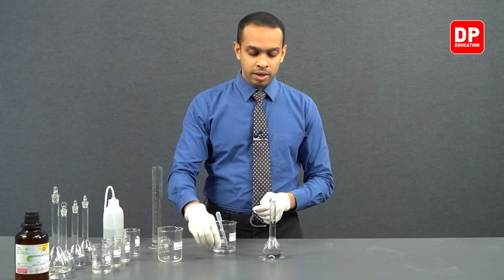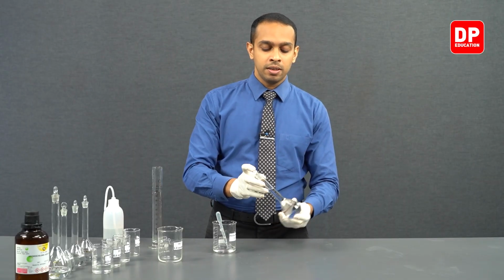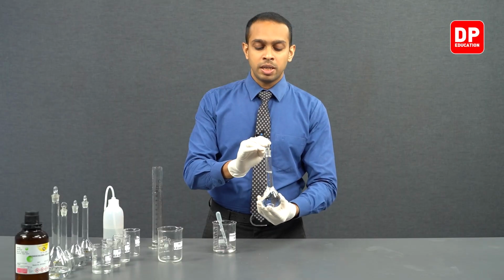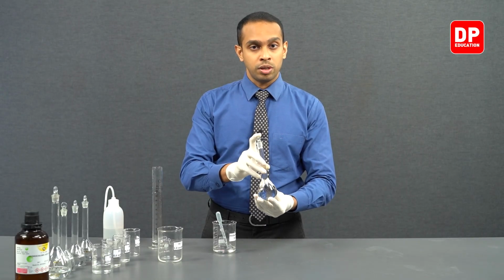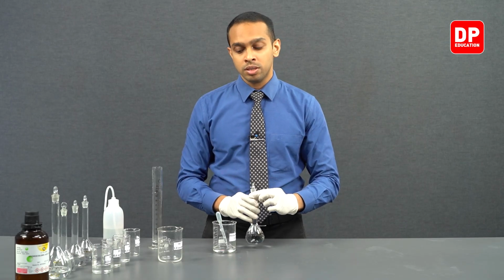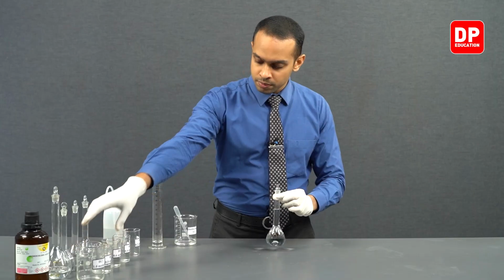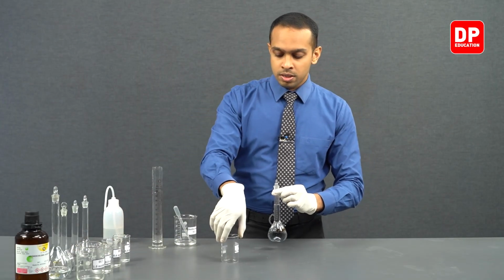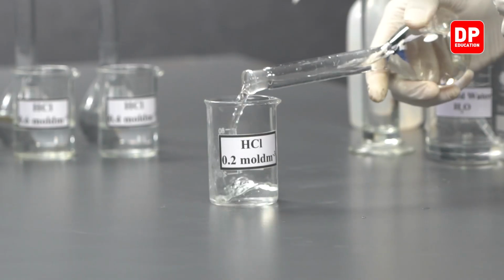water. We can now proceed to place the stopper on the volumetric flask and then turn it upside down a few times to mix the solution really well. Now students, we have prepared our final solution, which is 0.2 moles per decimeters cube concentrated HCl solution.